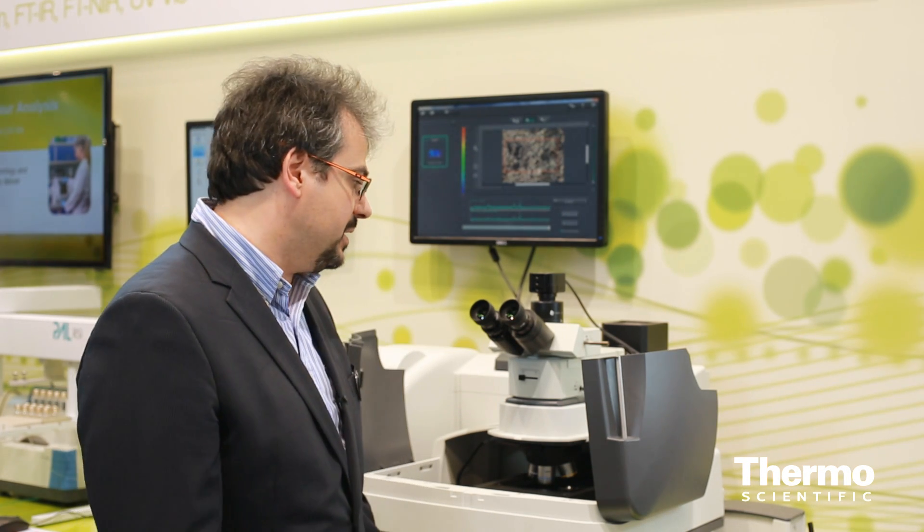Hello, my name is Massimiliano Rocchia and I'm here to present you the new Thermo Scientific DXR imaging microscope. This instrument is really new in the Raman market because it has completely changed the philosophy, moving from spectra-centric instruments to image-centric instruments. This is something very different for Raman.